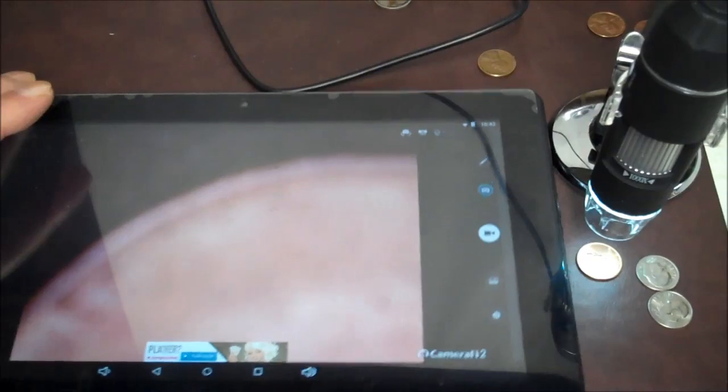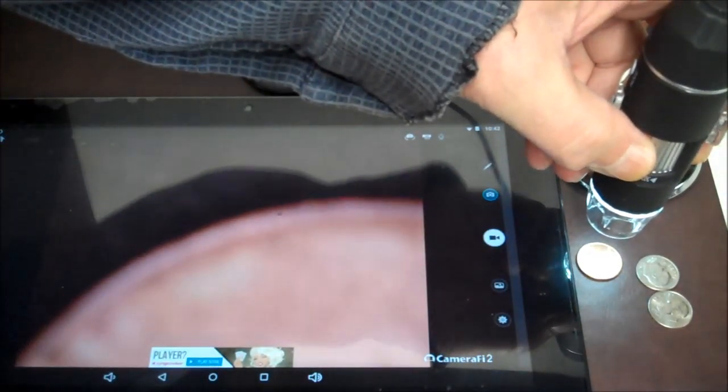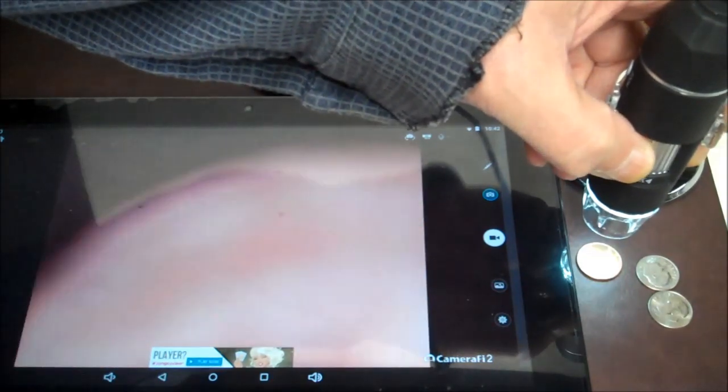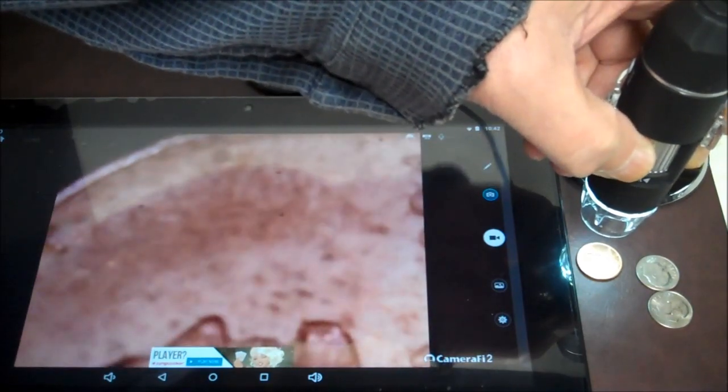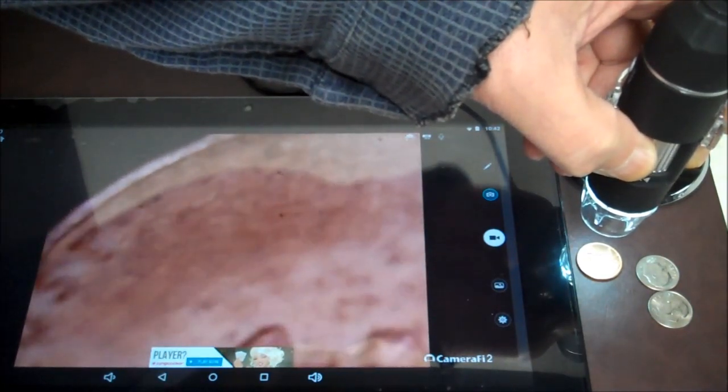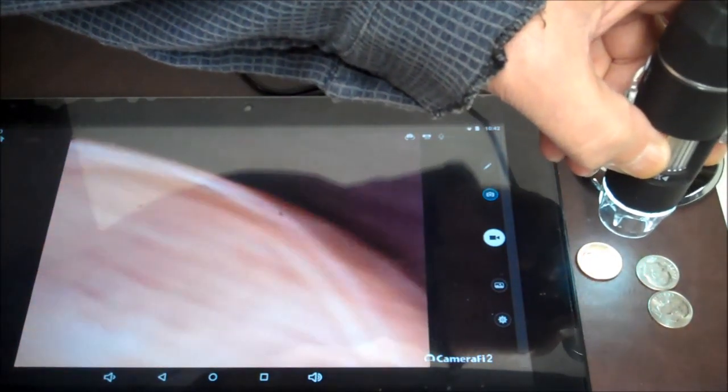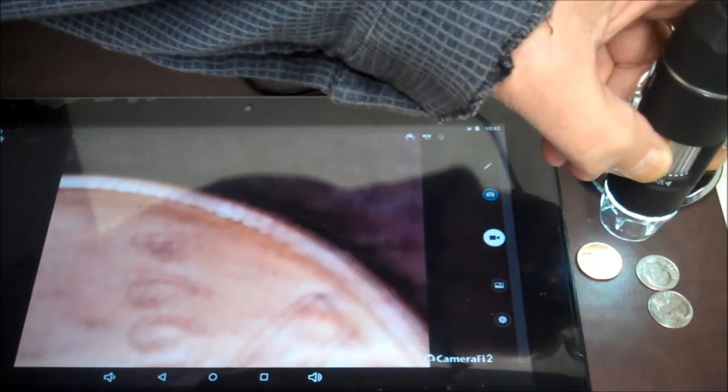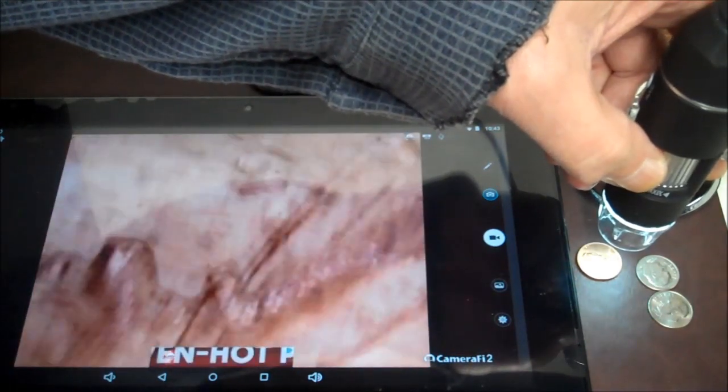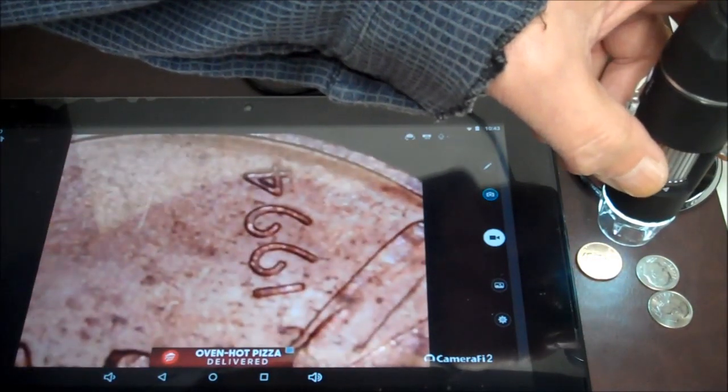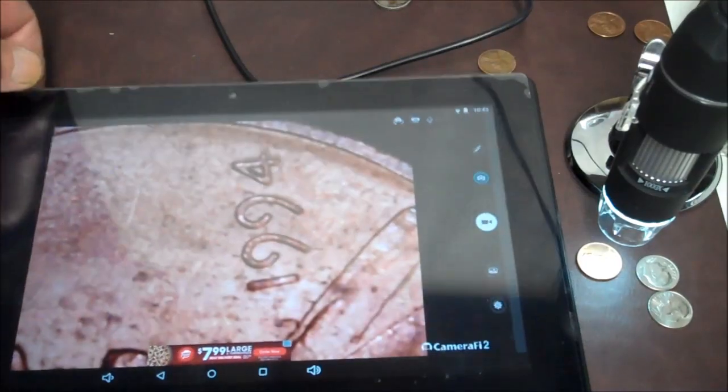Okay, now you can see it's on, right? Now let's focus on that penny there. So I'm just going to adjust the focus knob a little bit. And you can see you get a nice, nice close-up. There's the date 1994. You see the annoying ads popping up. There you go. I don't know if you can see that too good.